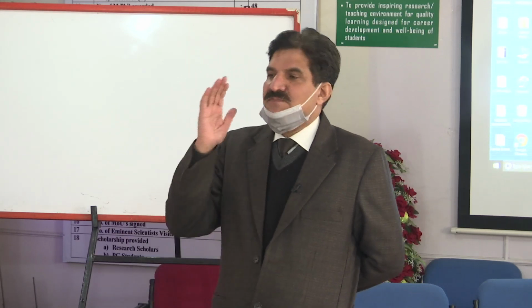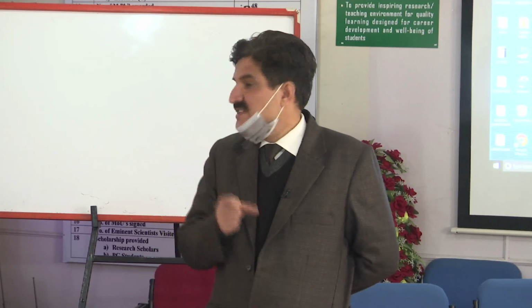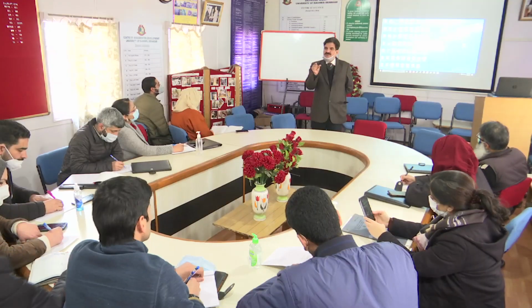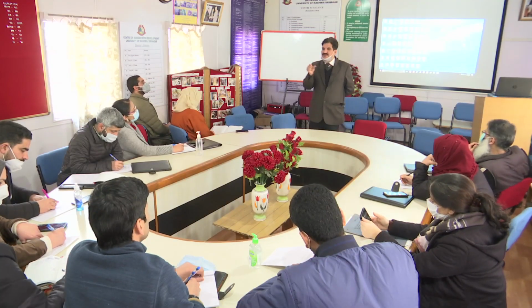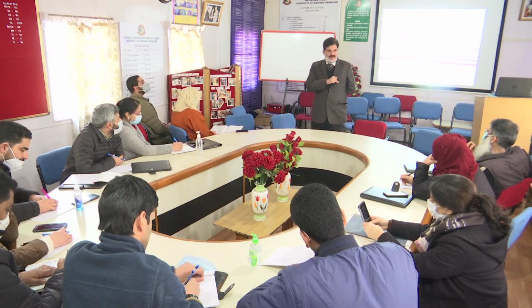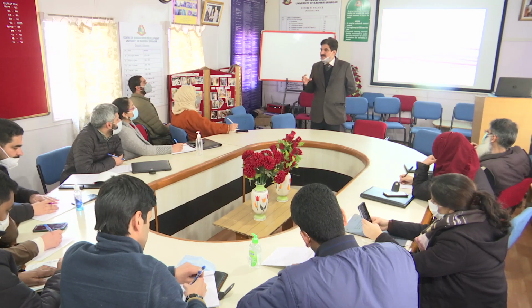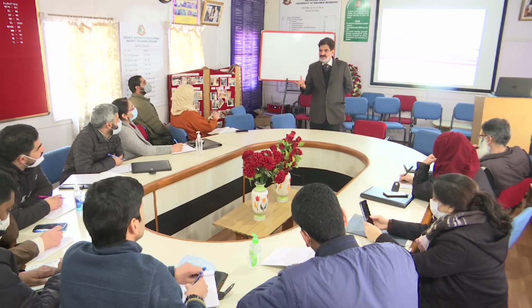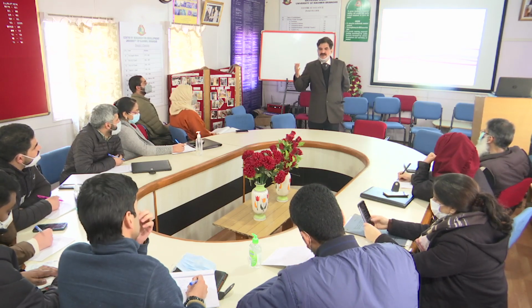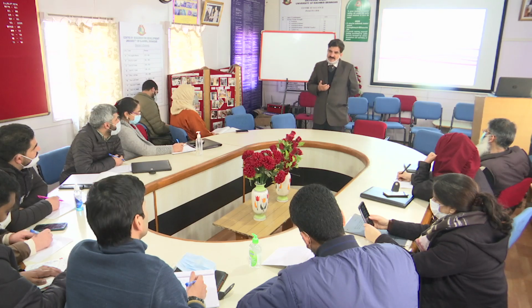So your first step in the mechanism for isolation of DNA is to rupture the cell, so that the nucleus or nucleoproteins will come out. That can be achieved by various methods. In the case of bacteria, you have peptidoglycan there.